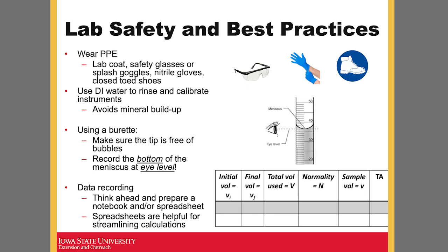Also, when you are getting ready to do any measurement, when you use a pH meter, burette and all that glassware, make sure you rinse all your equipment with deionized water, just to rinse any particles that could stay there and could be negative for your future measurements.